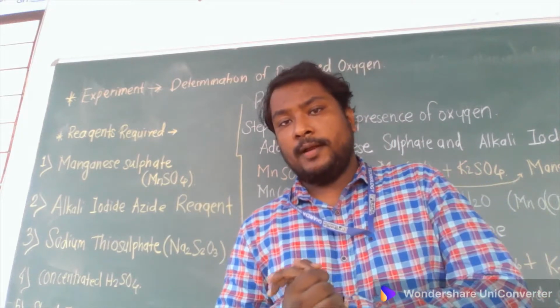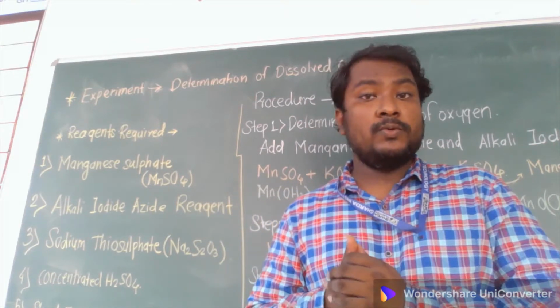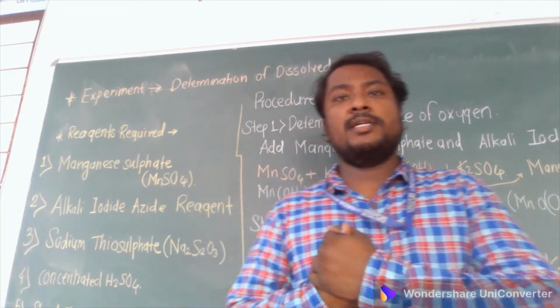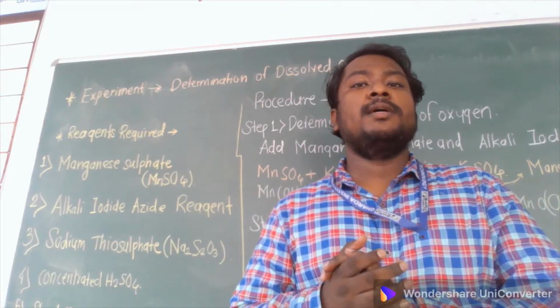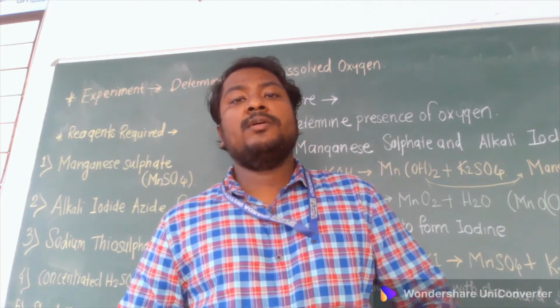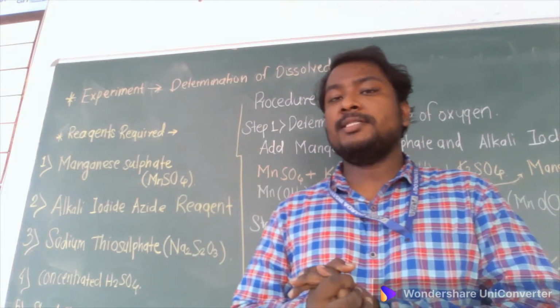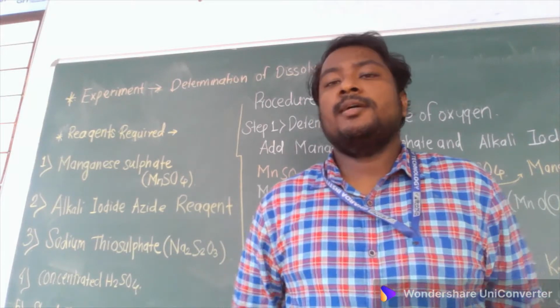Hello everyone, and we will see a very important experiment. I have discussed all the theoretical parts related to the significance, theory, and usefulness of this experiment, that is nothing but dissolved oxygen, and it is newly introduced into the syllabus. Previously, the dissolved oxygen experiment was limited to wastewater, but now, realizing the importance of this experiment, the syllabus has been rescheduled and they have introduced this new experiment, that is nothing but dissolved oxygen.